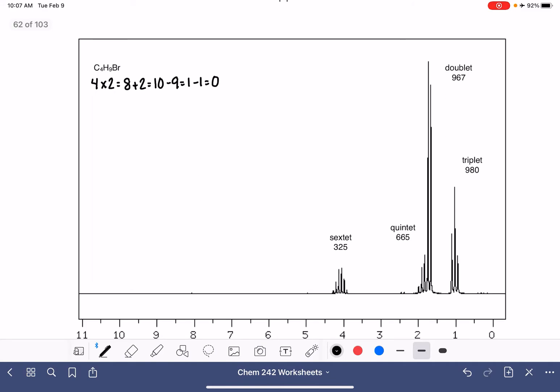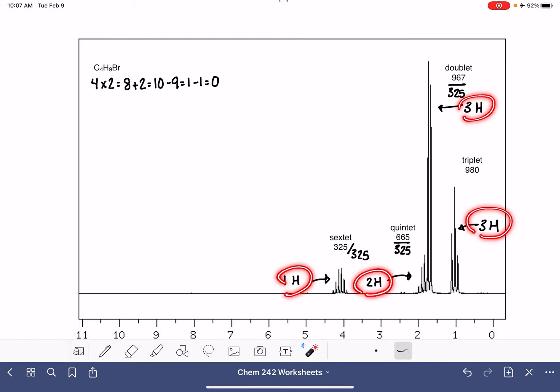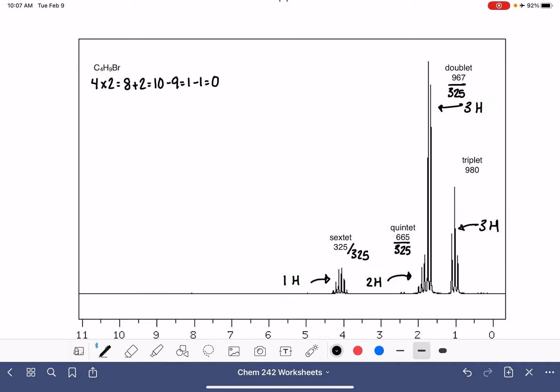Now we're going to analyze our integrals. Our smallest number is 325, corresponding to one hydrogen. Our quintet at 665 is most likely two hydrogens. Our doublet at 967 divided by 325 is three hydrogens. And this triplet will also be three hydrogens. Let's add them up: 1 plus 2 plus 3 plus 3 adds up to 9. We have 9 — looks good.